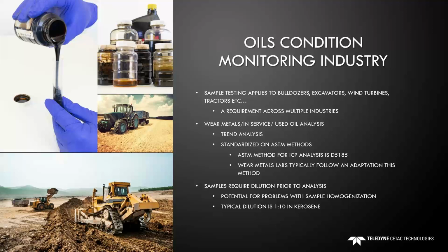Those that are actually doing the analysis are frequently referred to in multiple different ways. Wear metals analysis is one of the most common. They're also commonly referred to as in-service laboratories or used oil laboratories. That's all within this condition monitoring industry. So they have several different names within the vernacular, but they're all doing similar work, which is trend analysis, as I mentioned, based off of a series of samples.